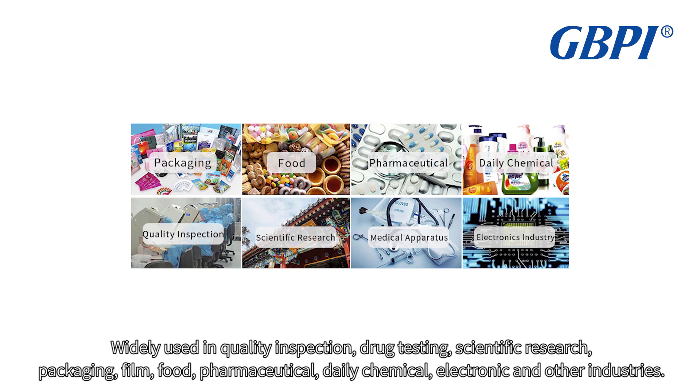Widely used in quality inspection, drug testing, scientific research, packaging, film, food, pharmaceutical, daily chemical, and electronic industries.